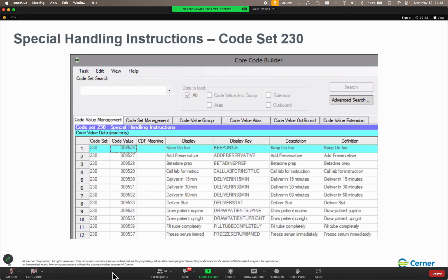Because with a sequence of 6, we'll have 5 characters for the year and day, 6 characters for the sequence, we're up to 11, and then 1 character for the accession, or the container ID. But that only works if we're not using site IDs or site prefixes. You add site prefixes into the mix, and we have a max accession size of 12. Well, then we start getting truncation happening. So let me go ahead and show you what I mean here.